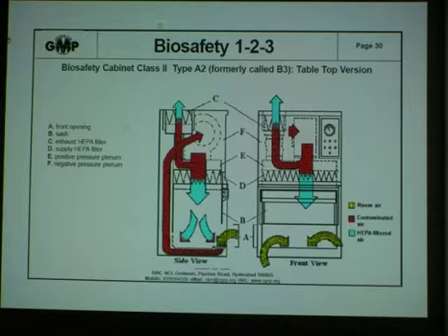Secondly, you find that there is no part of the system where there is air that is contaminated which is at positive pressure. All contaminated ducts are under negative pressure. This means if there's any leak in the duct, room air will get sucked into the duct, but the contents of the duct will not leak into the room.